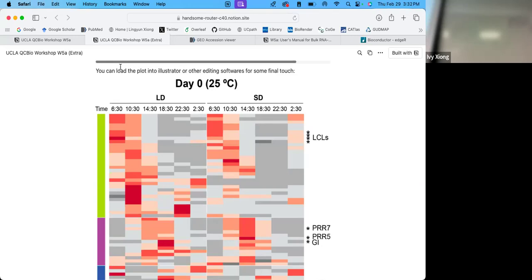Oh, it's a different console. The R script is for bash, not for R. So it's like running R in a bash environment with this script. Could you have written your script in R and then run it in R?